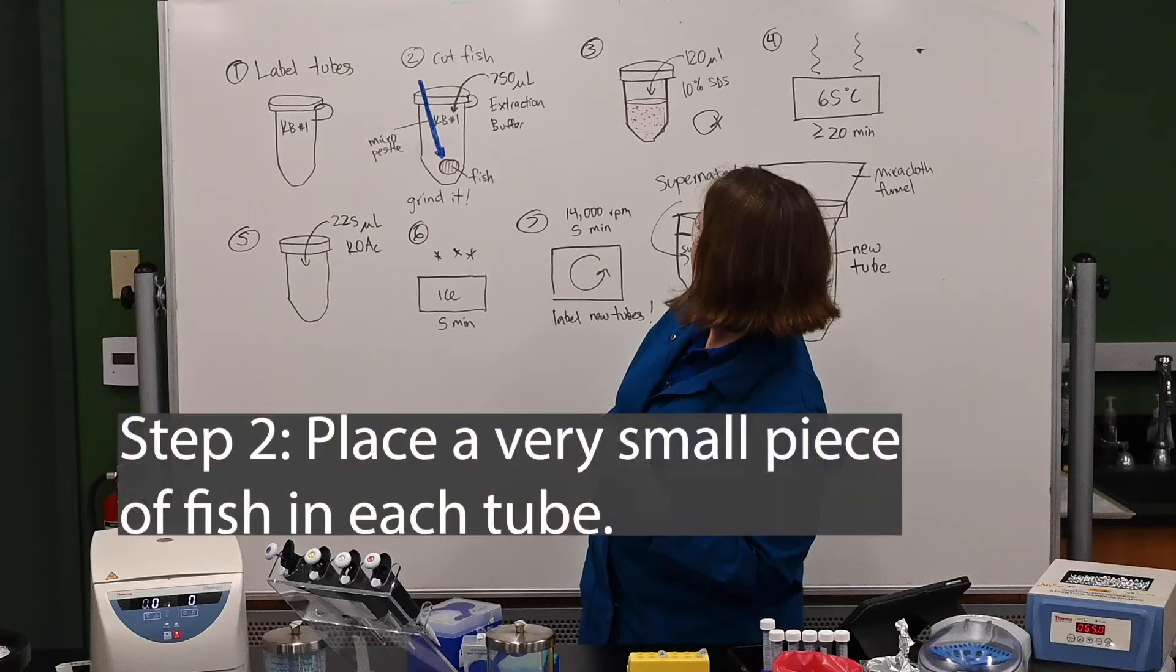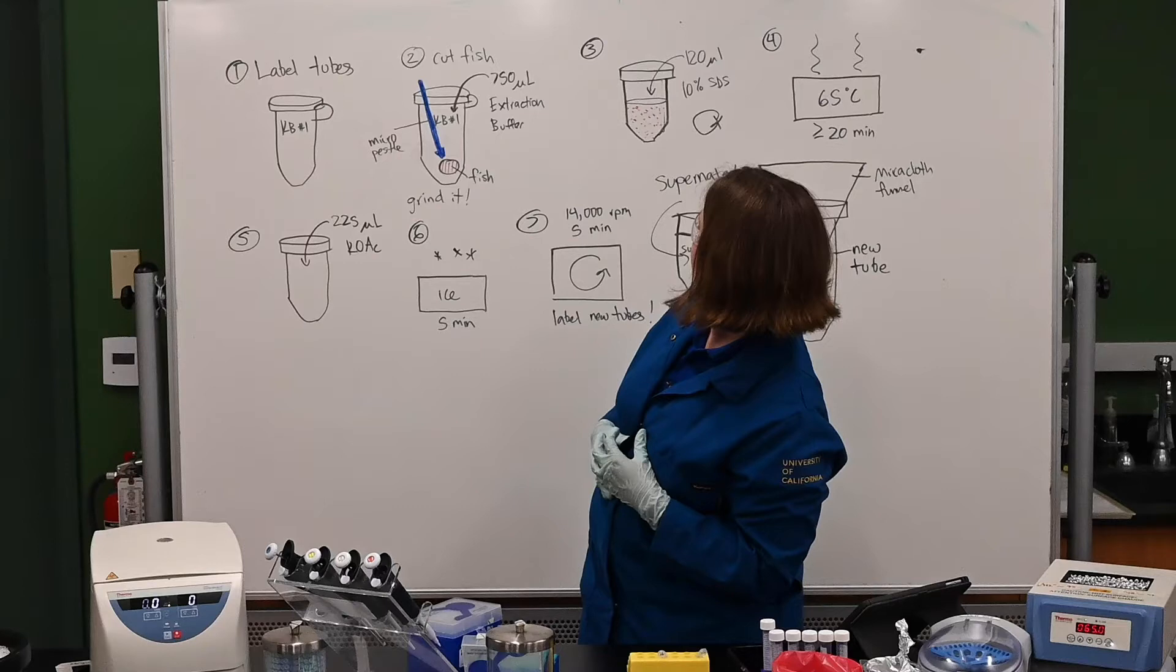Step two, you're going to cut a very small piece of fish and place it in each tube. Next I'm going to add 750 microliters of DNA extraction buffer to each tube.